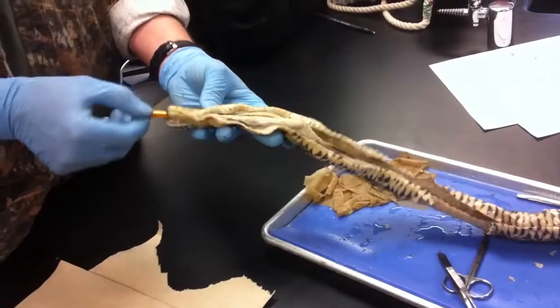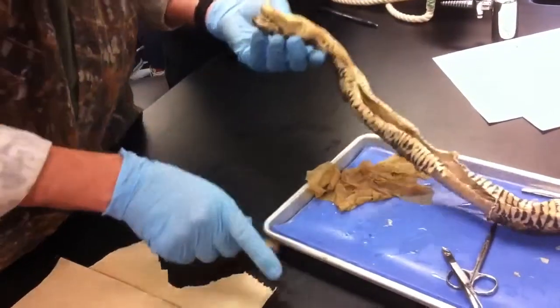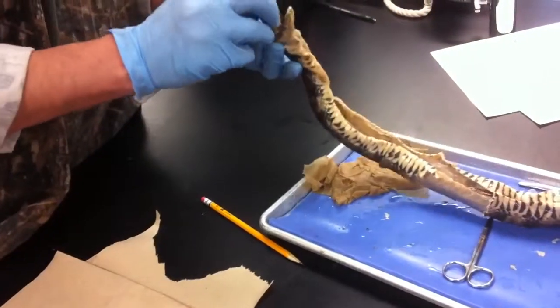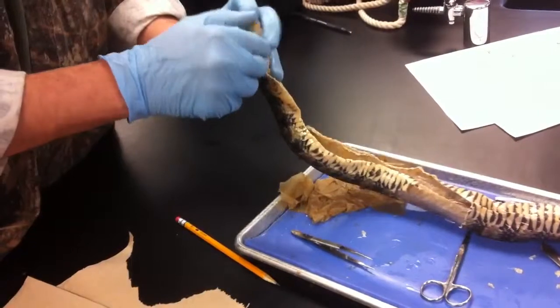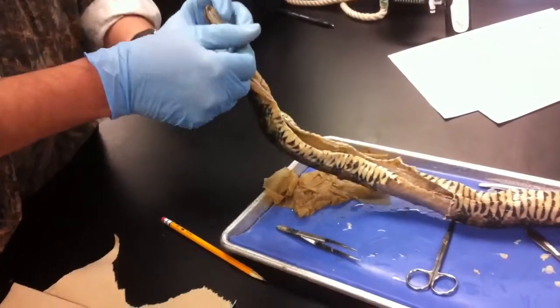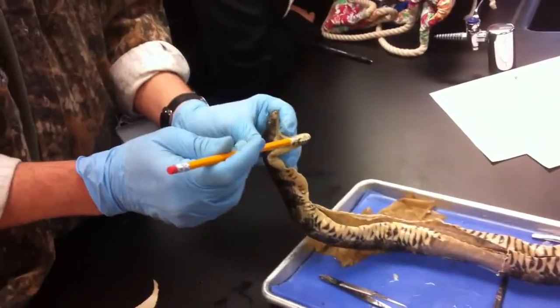So there's the esophagus. All right. Give it the fangs. We used the ones that were curly. And the floor of the mouth, you have two openings way up front.